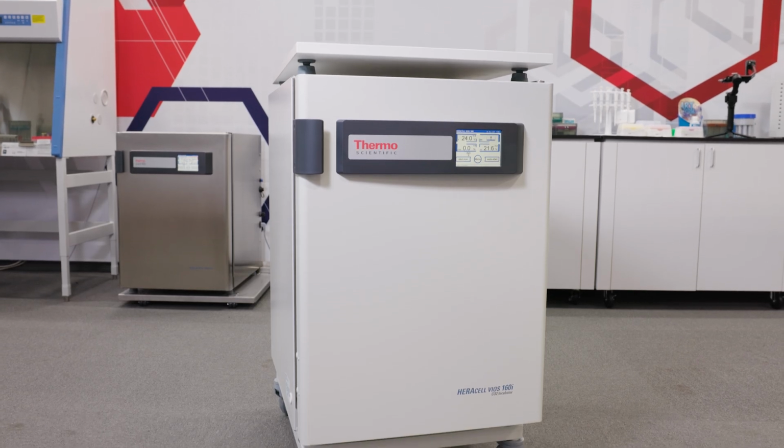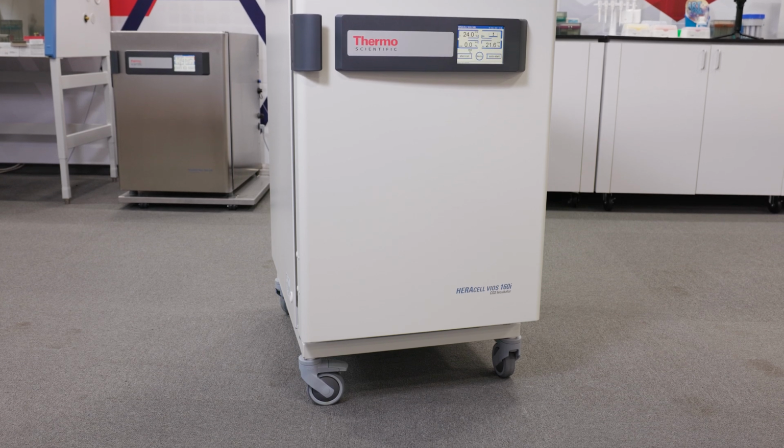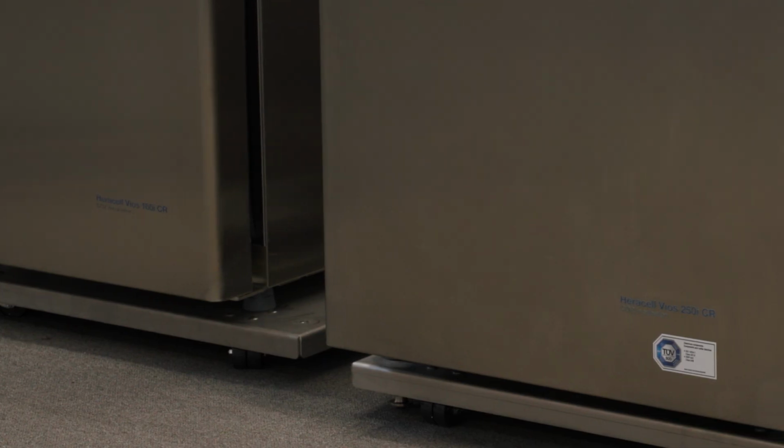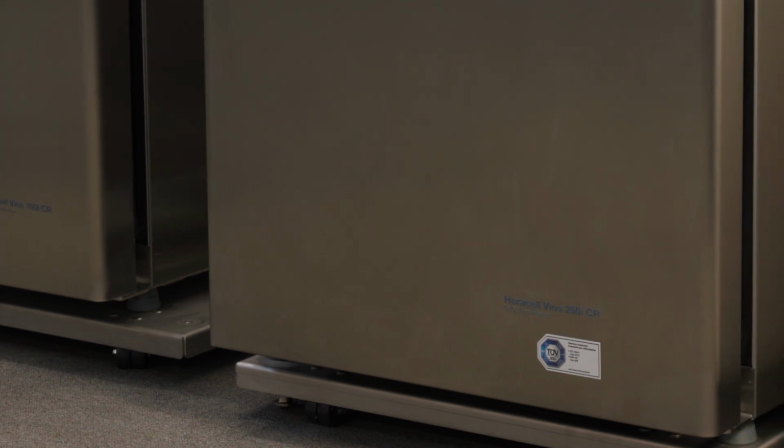If you plan to place your incubator on a floor stand or lab table, that substructure must be vibration-proof and capable of bearing the weight of the device and its accessories, especially if several devices are stacked.